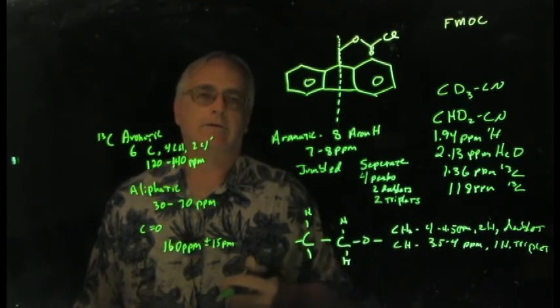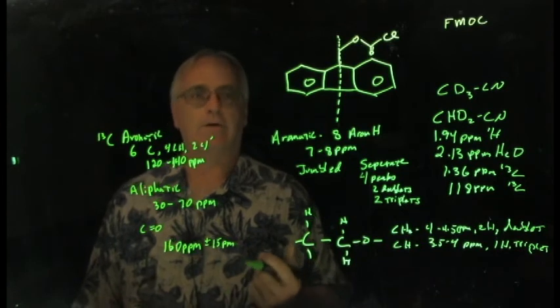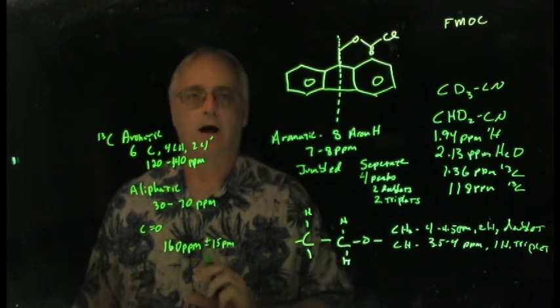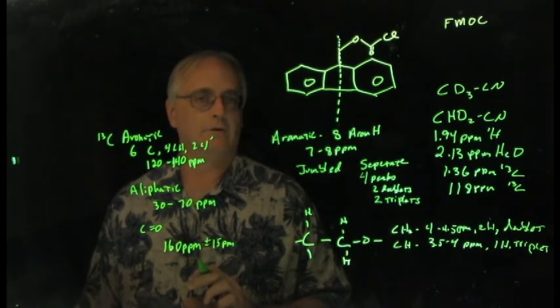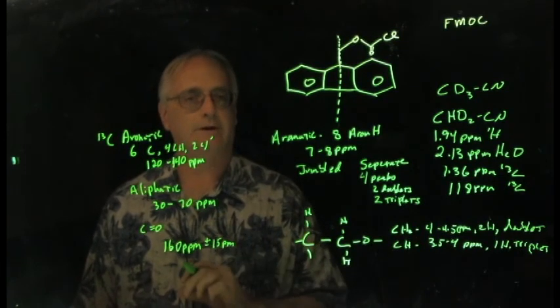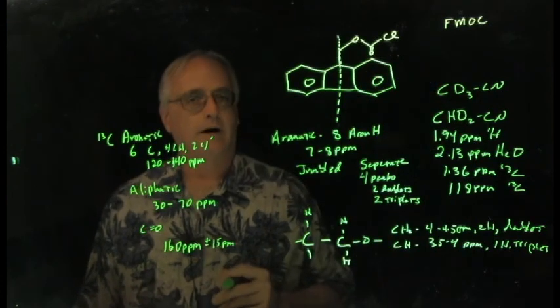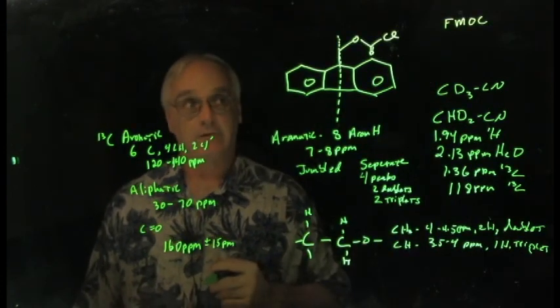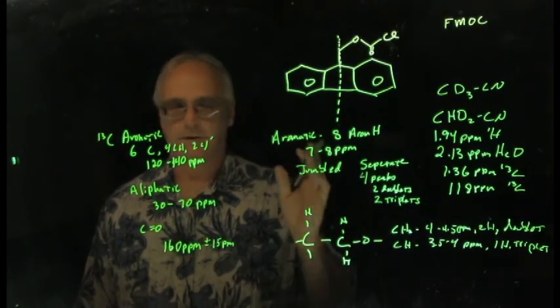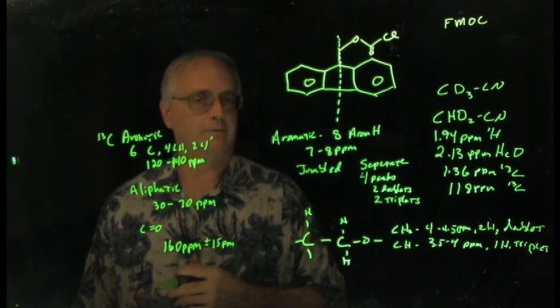So there we go. A nice illustration, I hope, of one of the more routine uses of NMR. We tend to focus on the big structural determination problems. They are great, but this is a much more common sort of thing we use NMR for. Check your starting materials. Make sure they are exactly what you expect them to be and that they are pure. Water is a common contaminant. If we had synthesized this molecule and we recrystallized it from acetone or hexane, we would almost certainly see a trace of that solvent in the NMR spectrum as well.